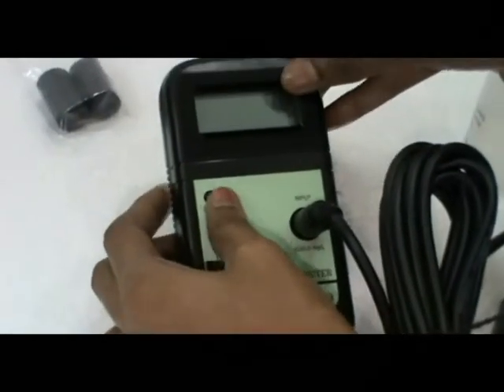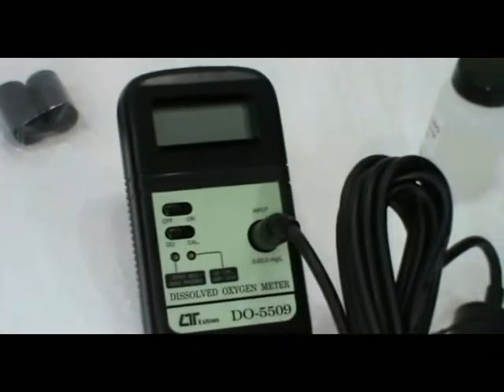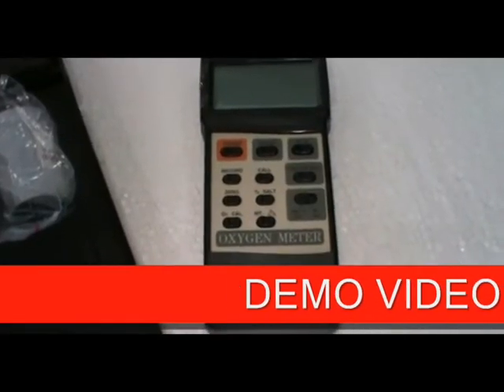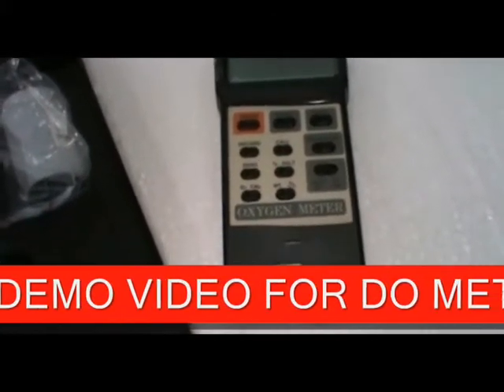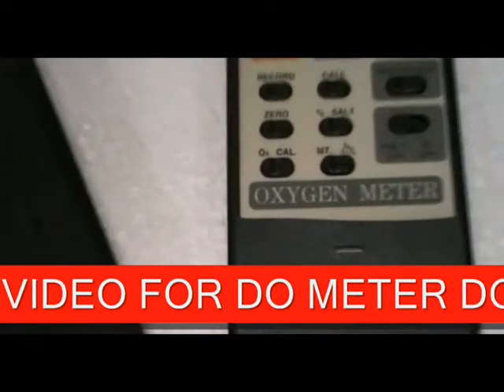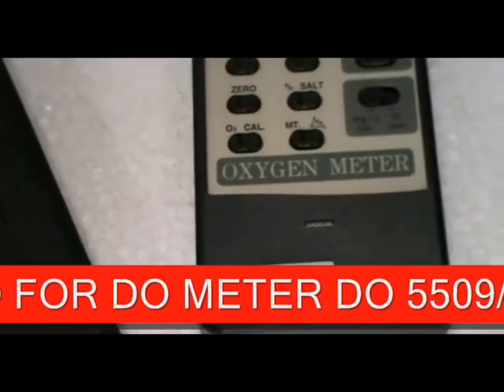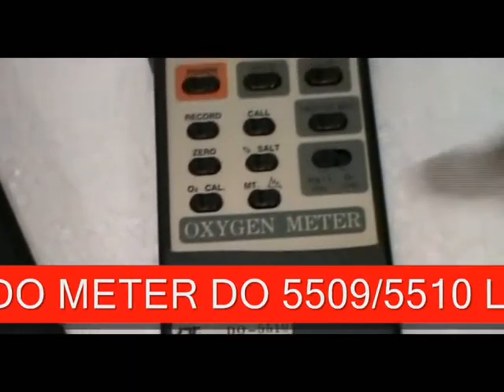Switch off. Next model is DO 5510. This is the auto calibration model.